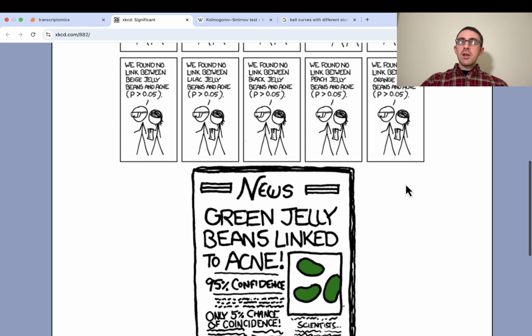Well, we'll call it epsilon. I'll make it 1. You could make it 0.1 or 0.01, or really whatever you want it to be. And then we'll calculate the log2 fold change like this, basically. We just take the mean of the control samples and the mean of the IPF samples. And then the fold change will be this fraction, except adding epsilon to both the top and bottom of the fraction. And then once we have the fold change, we'll take the log2 of that, and that will be our log2 fold change. Also, here it is for the first gene that we were working with.